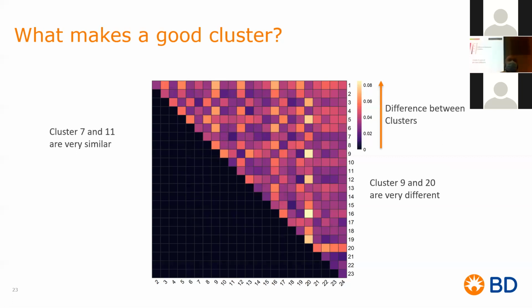So that is what I mean with looking at your data critically, but also thinking about what you know about immunology. A bioinformatician is going to tell you, hey, Christian, you have 24 clusters. The truth is that once I go through this, not all those 24 clusters are significant biologically.